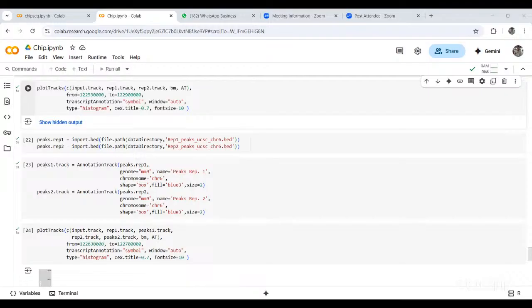The identification of the enriched region, often referred to as peak finding, is an area of research by itself, and that is why ChIP is mainly used. Among all the NGS experiments, ChIP identification is very common.